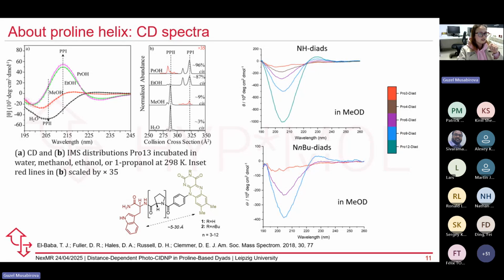We can detect it qualitatively with NOESY and TOCSY NMR spectroscopy in combination. Here are the results: for different amounts of prolines, we have different amounts of PP2 helixes.